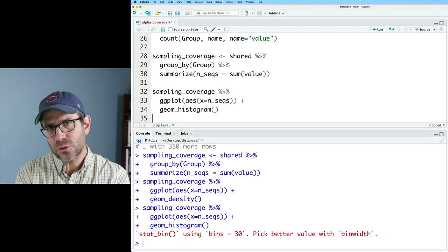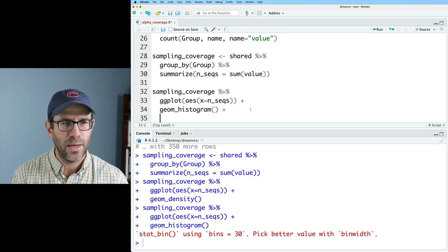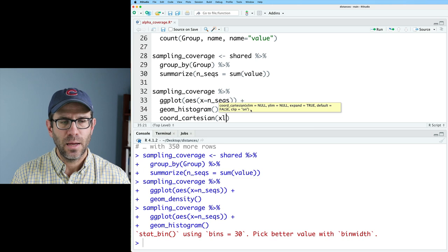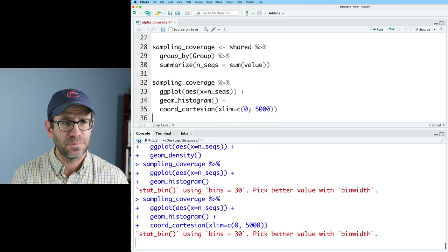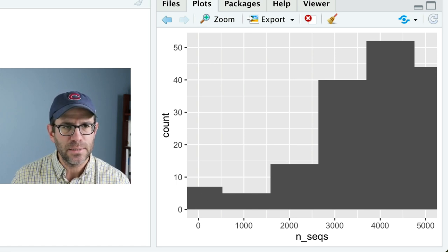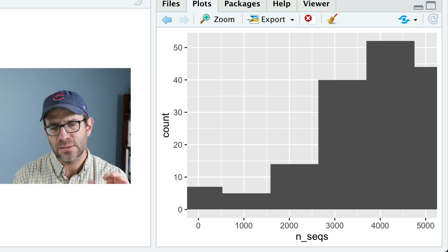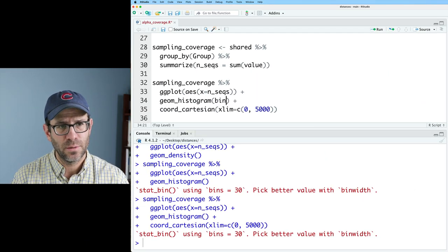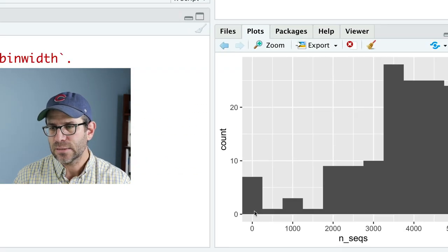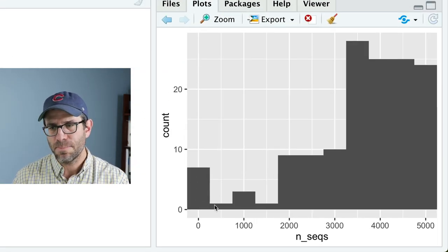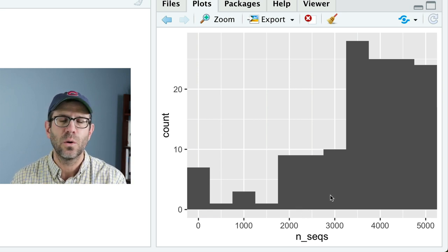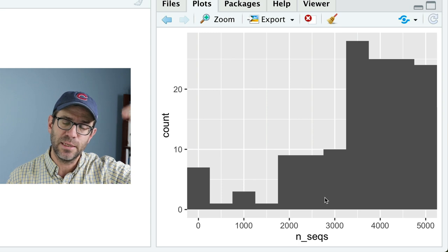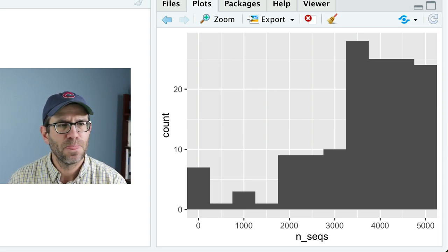So we could zoom in on our histogram. We could go ahead and do coord Cartesian, xlim, we'll do zero to let's say 5,000. And here we get pretty wide bins. We can maybe make the bins a bit finer. We could go ahead and do bin width equals say 500. And so we can see that right around zero we have some, and it isn't until we get to say 2000, 3000 or so, that the number of sequences in each bin starts to accumulate and be substantial.